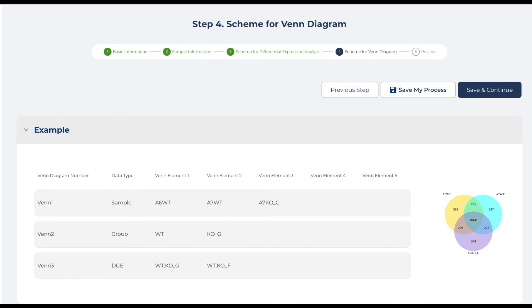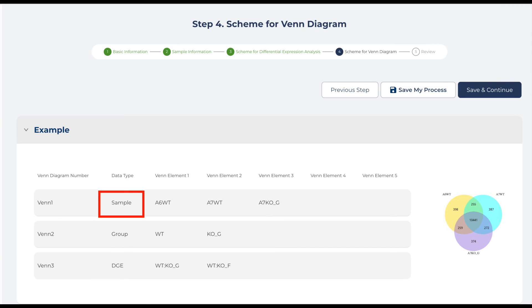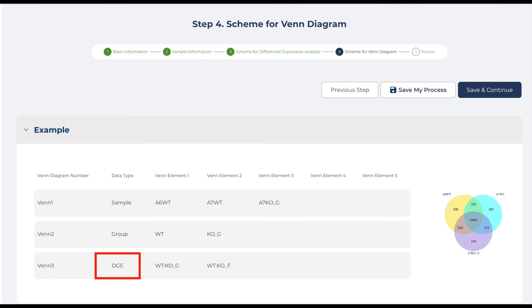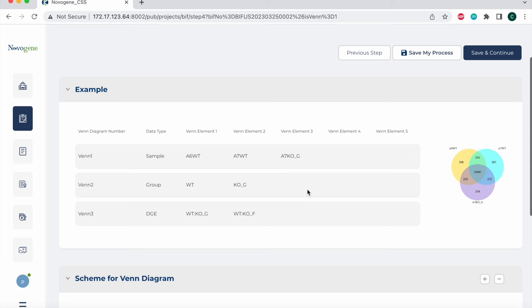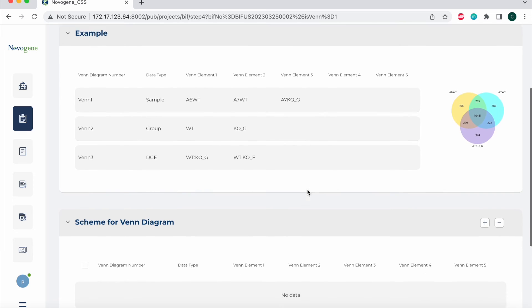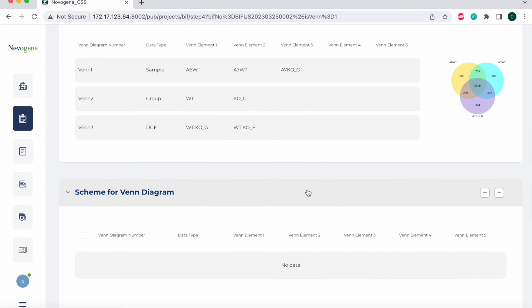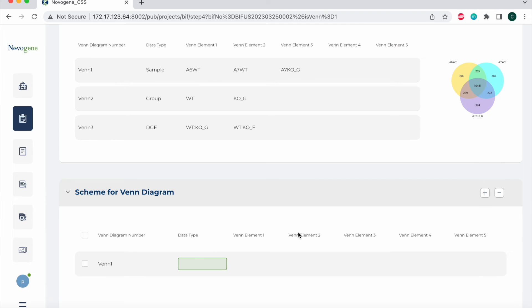Just like the other pages, we also provide an example of how to fill in the Venn diagram section here. As you can see, the Venn diagram section can be drawn based off three different types of data types. The first one being sample type, group name is the second one, and DGE or differential gene expression is the third one. When you scroll to the bottom, you will be able to add or subtract the different types of Venn diagram comparisons that you like. In this example, I'm going to hit the plus addition to add a particular Venn diagram.